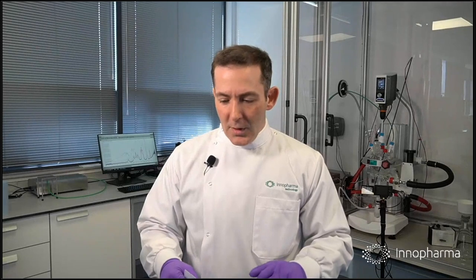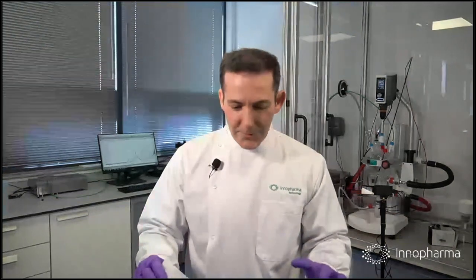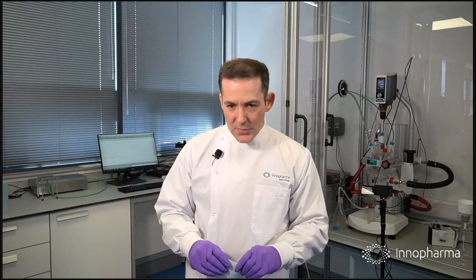Have I missed one? When you say moving average, it is a moving average in the case of this. Any experience with sensor jabber? Yes, absolutely. And in fact, some sensors have to be designed around using multiplexing to account for sensor jabber. Luckily, none of the sensors that we have in-house at the moment have that problem. I'm drawing a veil there, but that's because, in my experience in other industries, the trend is more important than the accuracy. Yes. Is that the case for the Raman technology, or is accuracy the key parameter? Okay, so yes.